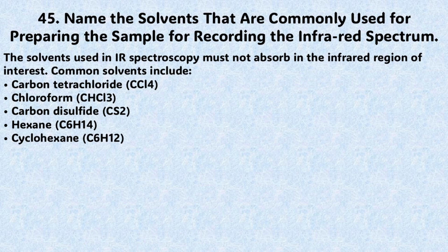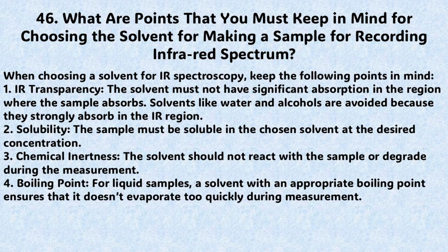Common solvents include carbon tetrachloride, CCl4, chloroform, CHCl3, carbon disulfide, CS2, hexane, C6H14, cyclohexane, C6H12.